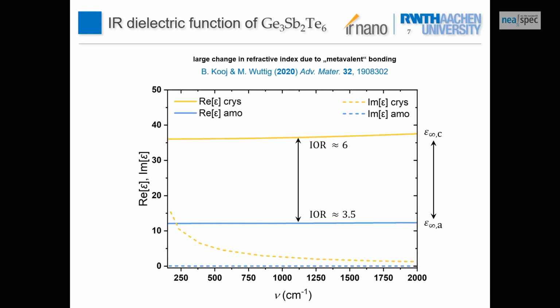So if we think that these two crystalline states could be different, we should be able to see this in the dielectric function. But because it's local, it's directly written and it's very small, it's difficult to measure this in the far field, for example. And that's why we want to use SNOM to investigate local changes to the dielectric function due to charge carriers. And because the sensitivity is highest at lower frequencies, it makes sense to do this at low frequencies.